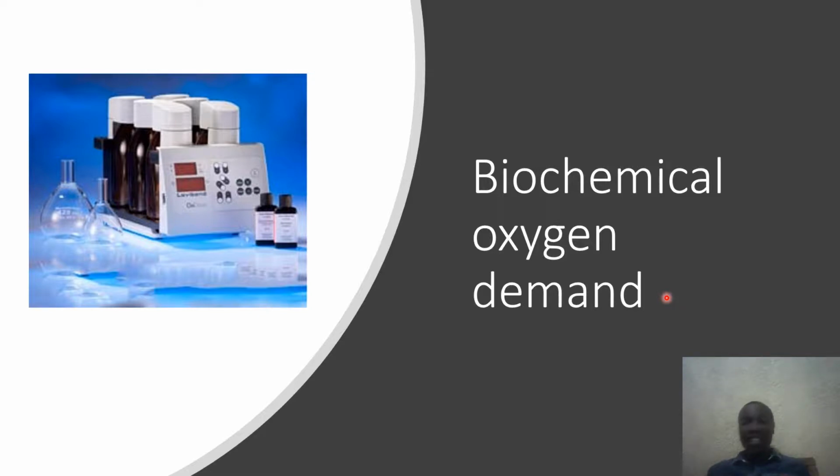And in this study, we shall get to know how to determine how much sewage is present in the water that we are fetching.